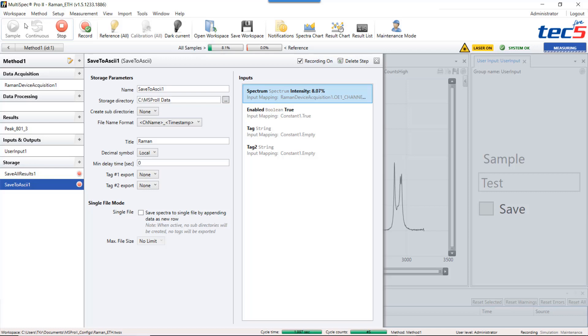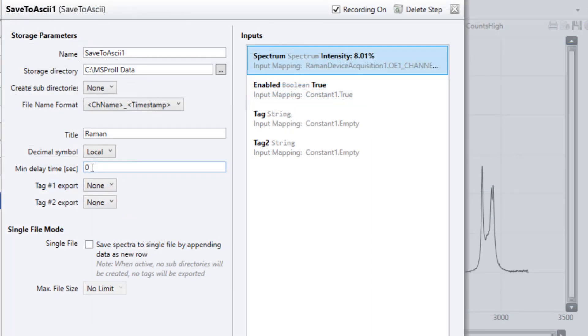In order to reduce the number of stored spectra you can use the minimum delay time. If you want to store a spectrum only every 10 minutes you enter a delay time of 600 seconds.